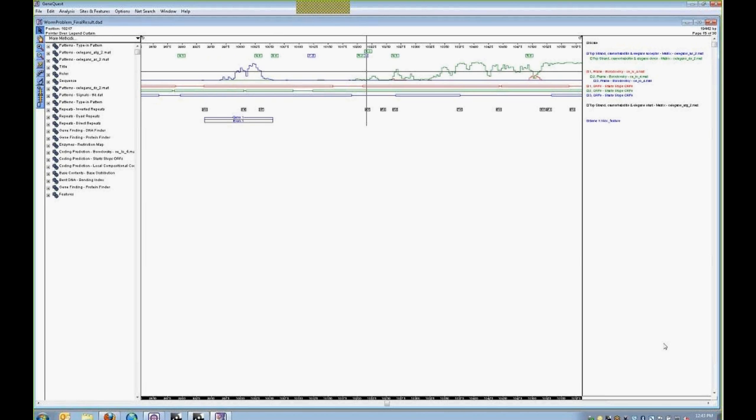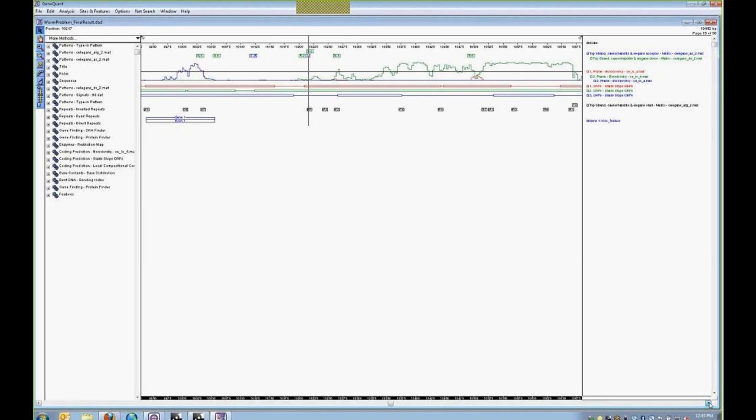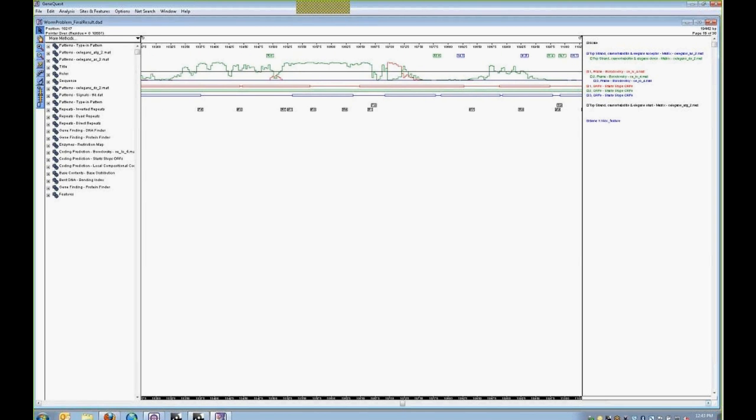So I can click on exon 2 and scroll to the end of our Borodovsky region. Again, this is in Open Reading Frame 2, so you can see the color coordinating with the ORF. We now find our donor site with a score of 12.6. Again, this is a very high score, so it's very likely the donor site for this particular exon.